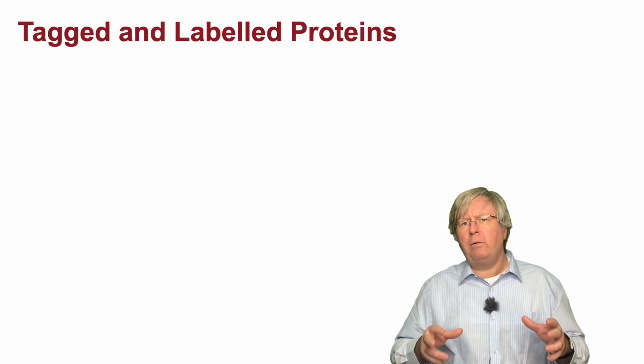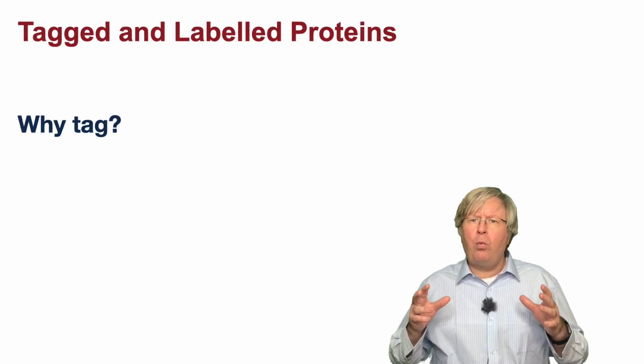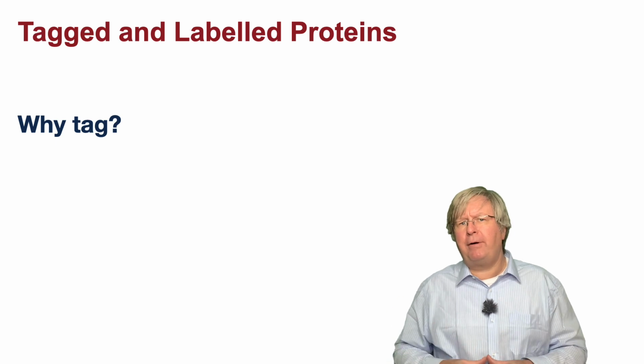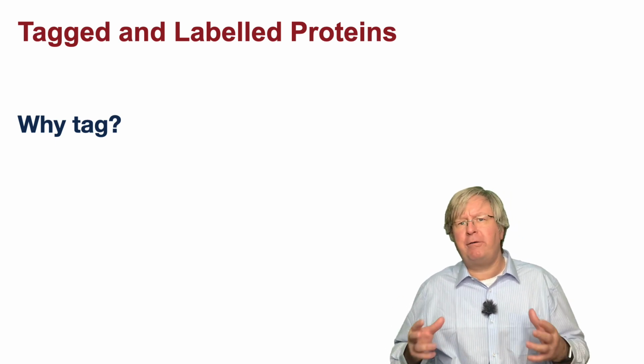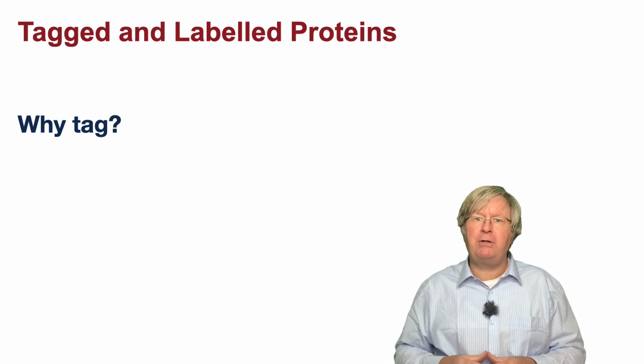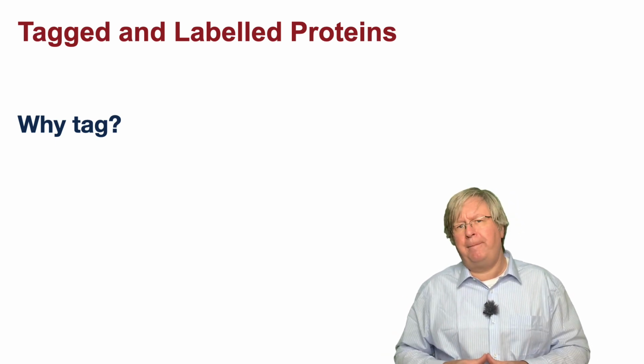In this video, we will look at how we can tag and label proteins. So, why would we want to tag or label a protein? Well, in the lab, we often want to produce proteins for experiments, or we may want to produce a protein for the treatment of a disease or condition.